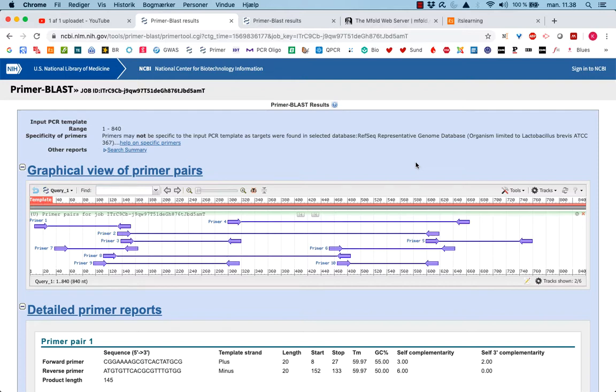Okay, now we have checked our primers with oligoanalyzer to see if they can do anything with themselves. And actually the Primer Blast program has tested if the primers will have homology to anything in the database. So that's fine.